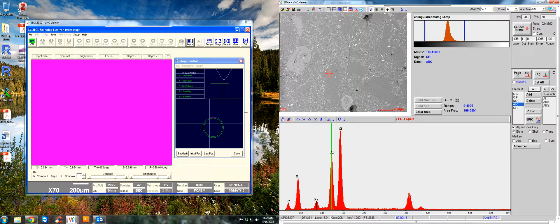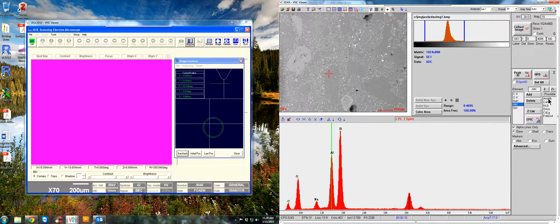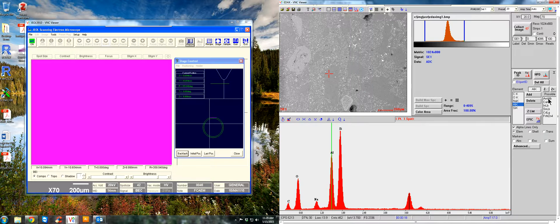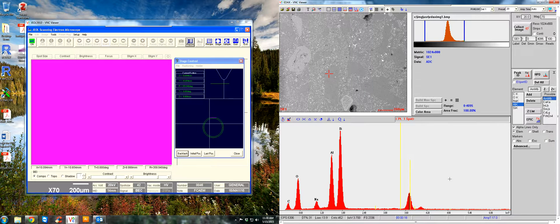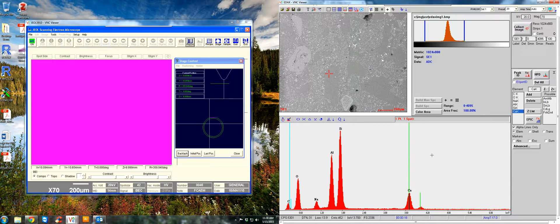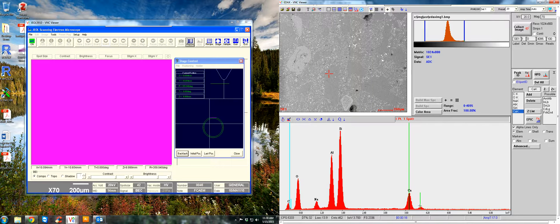And then over here, let's find out what this one is. I don't think an americium M-beta peak is there. But you can click on it just to see if it could possibly be that. But see these yellow lines over here? There should be peaks here as well, which isn't the case. So then it's most likely calcium. So we'll add that. So you've identified all the elements in this phase. Looks like it's plagioclase.